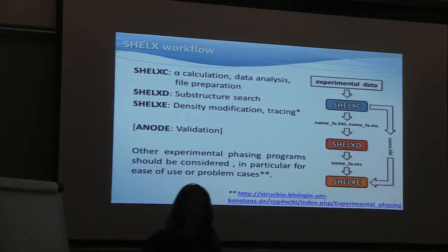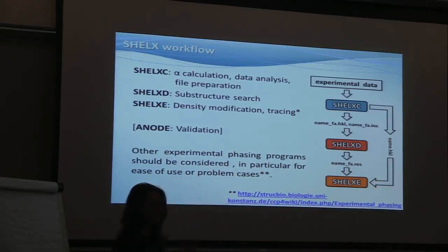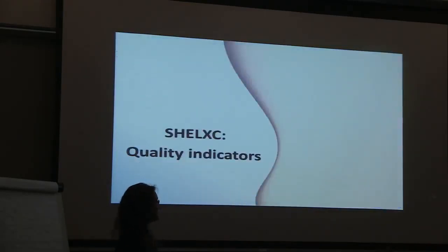I will go through the programs in approximately this order today, showing some new features or some not so well-known things you can do when stuff doesn't work. The first thing I'm going to talk about are SHELXC quality indicators.